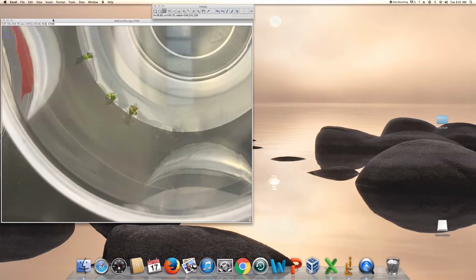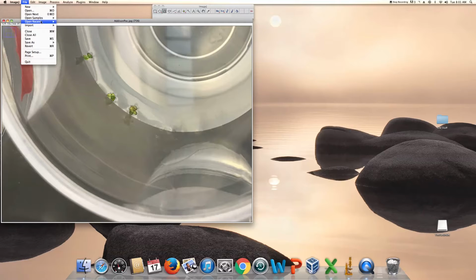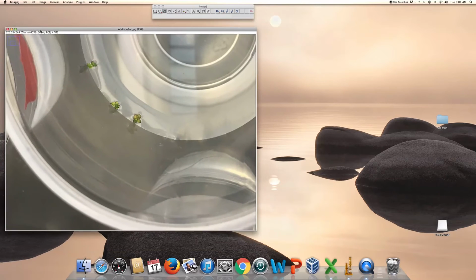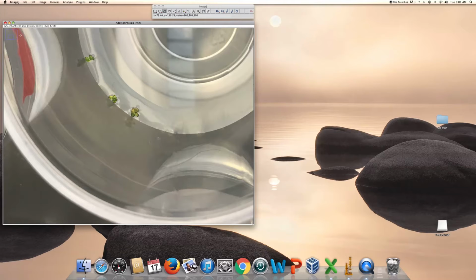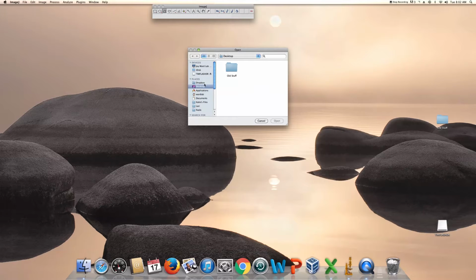When you're done with that photo, you'll probably move on to the next. If you've got all your photos in the same place, you can hit Open Next. I really like this. It'll just go to the next automatic photo. I don't know what's actually going to pop up here because I don't know what other photos I have on this flash drive, but they're not duckweed. Looks like I don't have other photos. You can exit out of this photo. We'll open another photo.